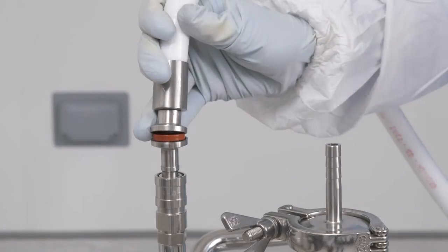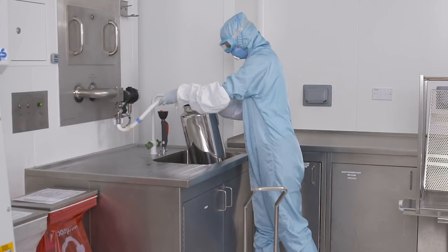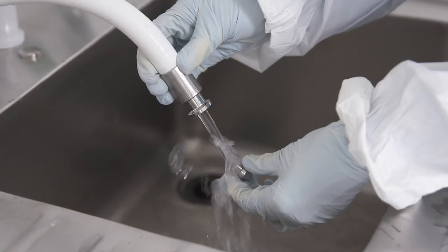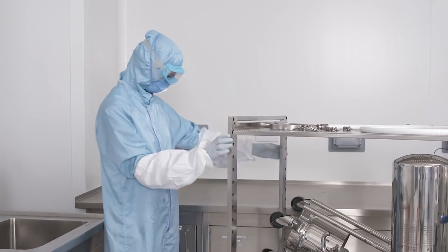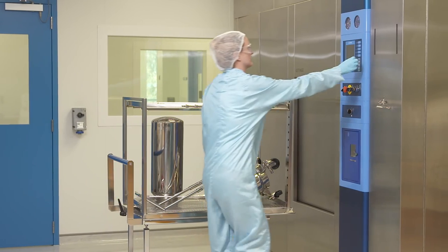All components can therefore be easily fitted into an industrial autoclave and positioned in such a way as to ensure the steam condensate can freely drain away and surfaces will rapidly dry.